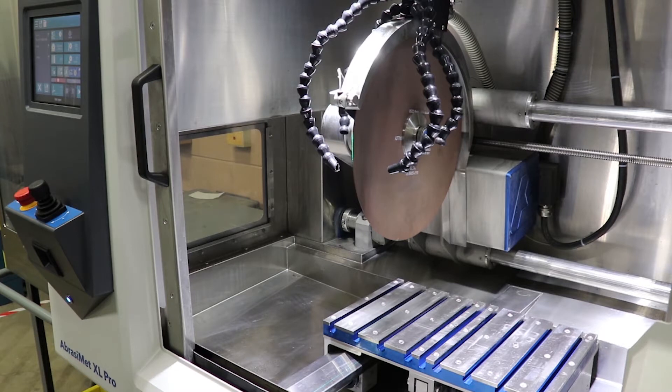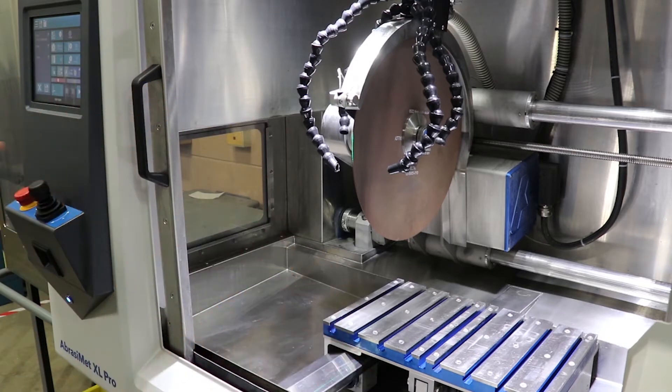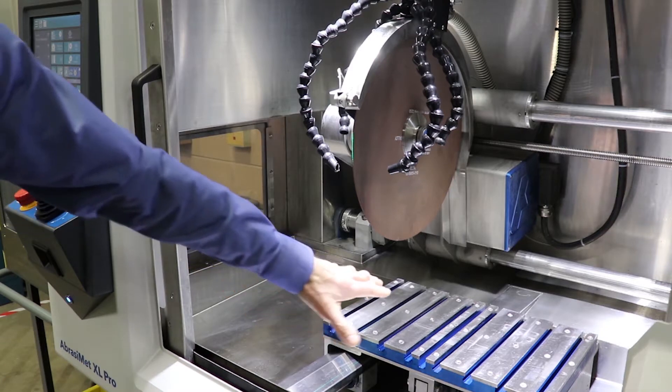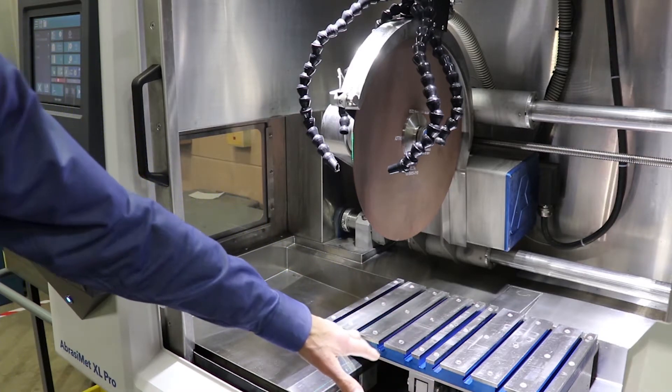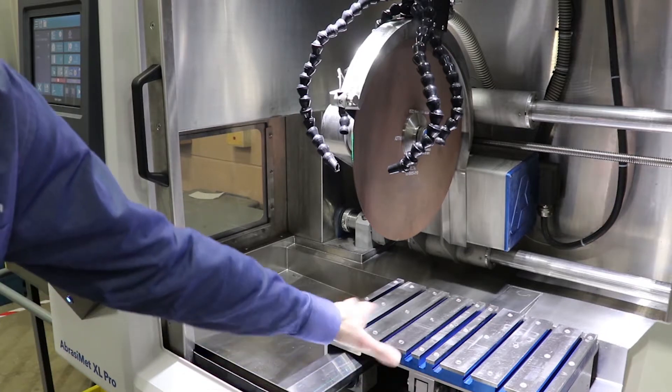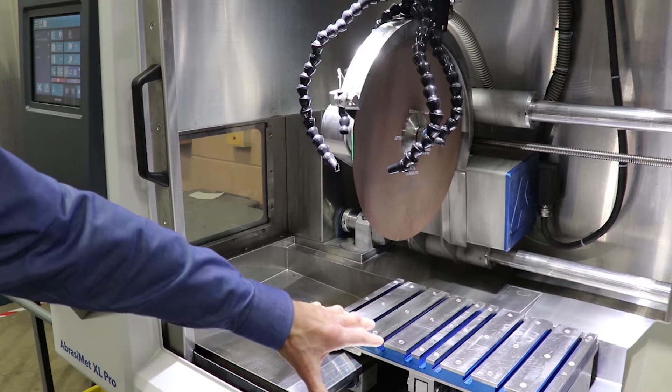A few of the design features we built into this machine in order to allow ease of use and convenience: here you can see a very well-lit cutting chamber — it's about three feet by two feet inside — with good visibility from the front and both sides. Under the vice table there's a lot of room to make cleaning very easy, with stainless steel components throughout and no lost parts under the vice table after cutting.